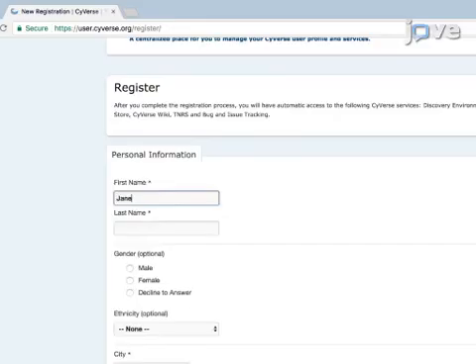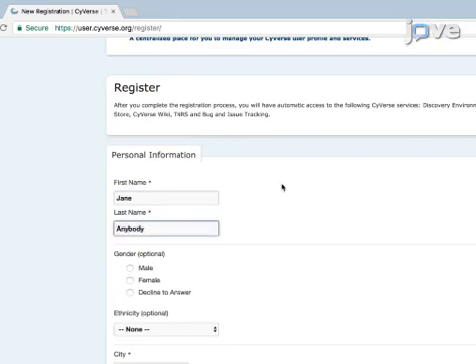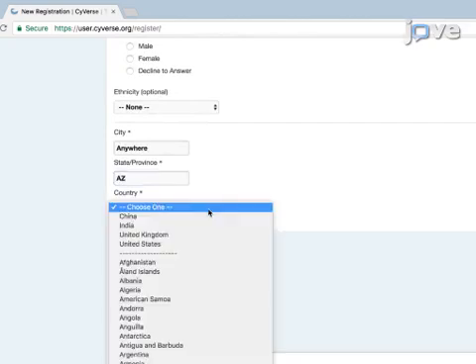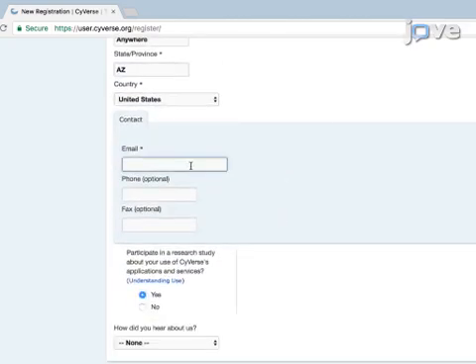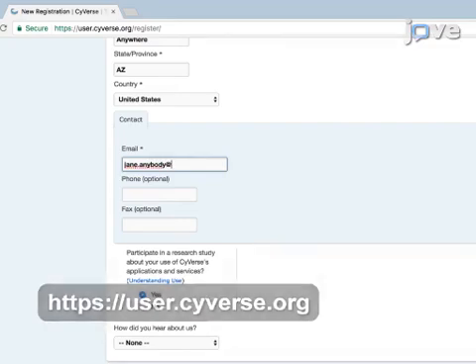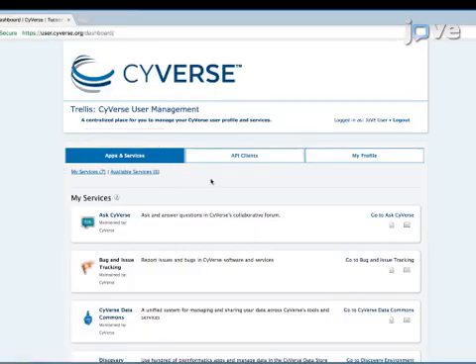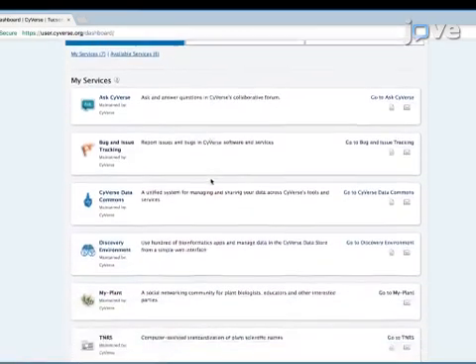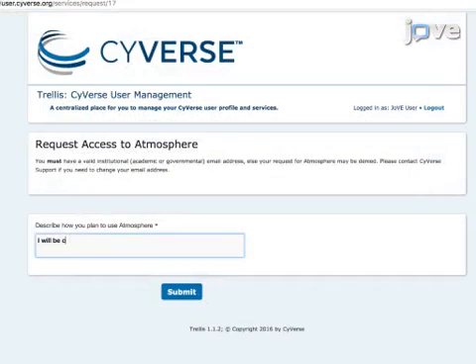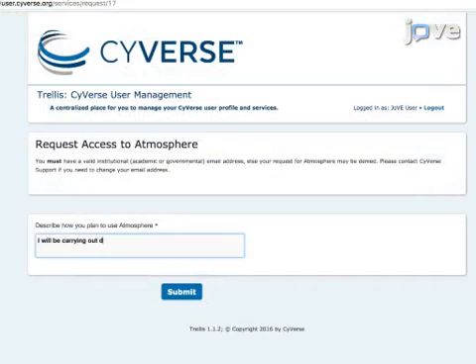To begin, get access to Atmosphere in the Discovery Environment. Request a free CyVerse account by navigating to the registration page. Use an institutional email to register for the account. Next, navigate to the apps and services tab and request access to Atmosphere. Access to the Discovery Environment is automatically granted.